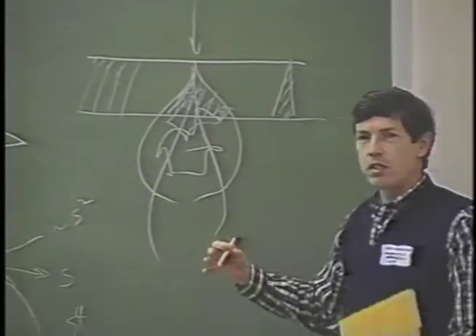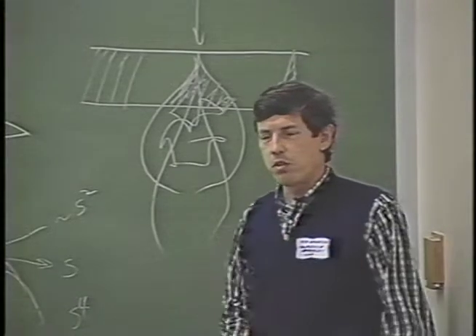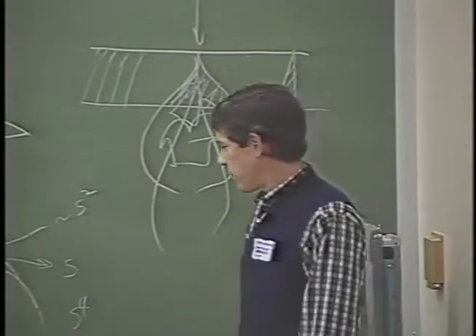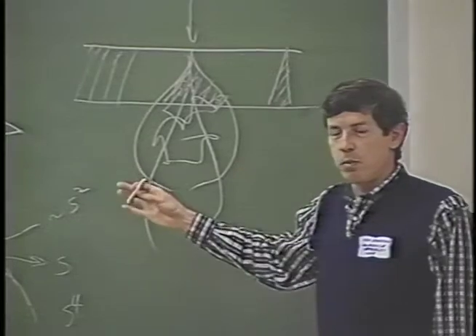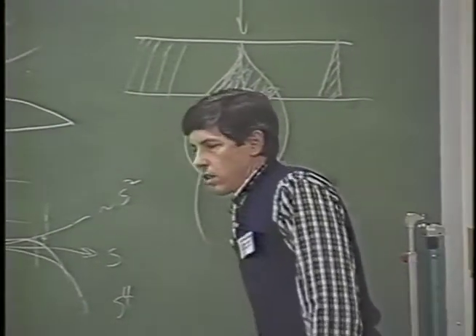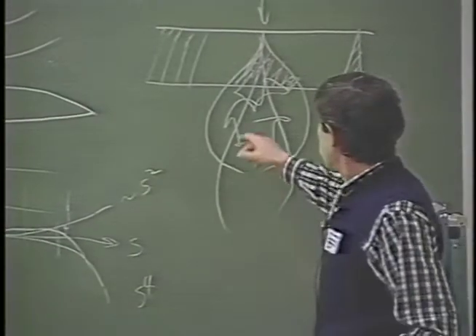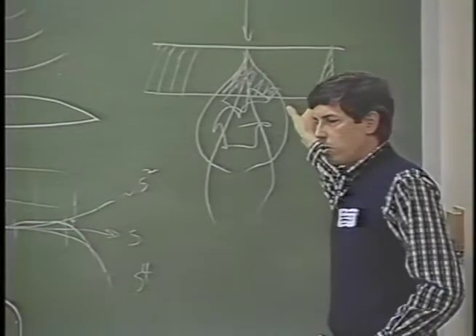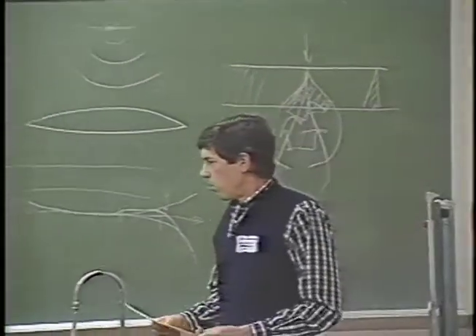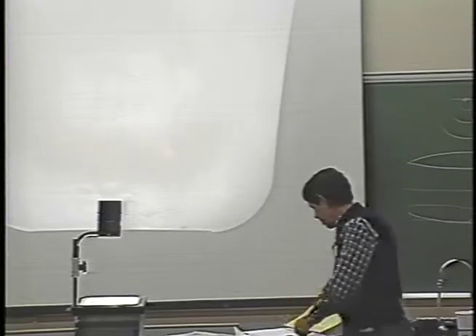What this means is that each electron will produce an image that's much narrower on the photographic film. Even though the image won't be as dark, it'll be a lot better defined. And years ago, I measured what amounts to the actual spreading of this in photographic films. We measured it in terms of modulation transfer functions, which is a representation of how good the contrast is at each spatial frequency.